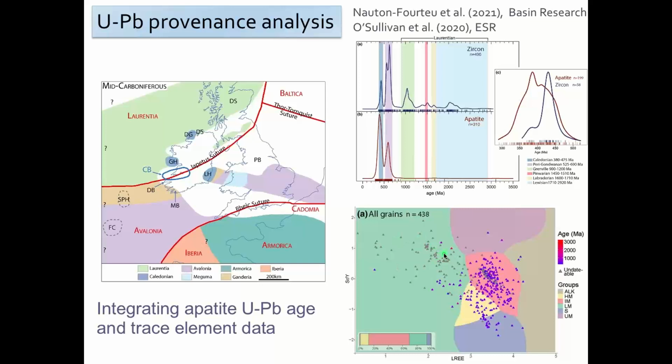And then we can identify potentially 4 different igneous fields: alkaline igneous rocks, which are marked here, and then intermediate I-type magmas, S-type magmas, and ultramafic magmas. So we can combine all this information to give much more diagnostic provenance determinations.